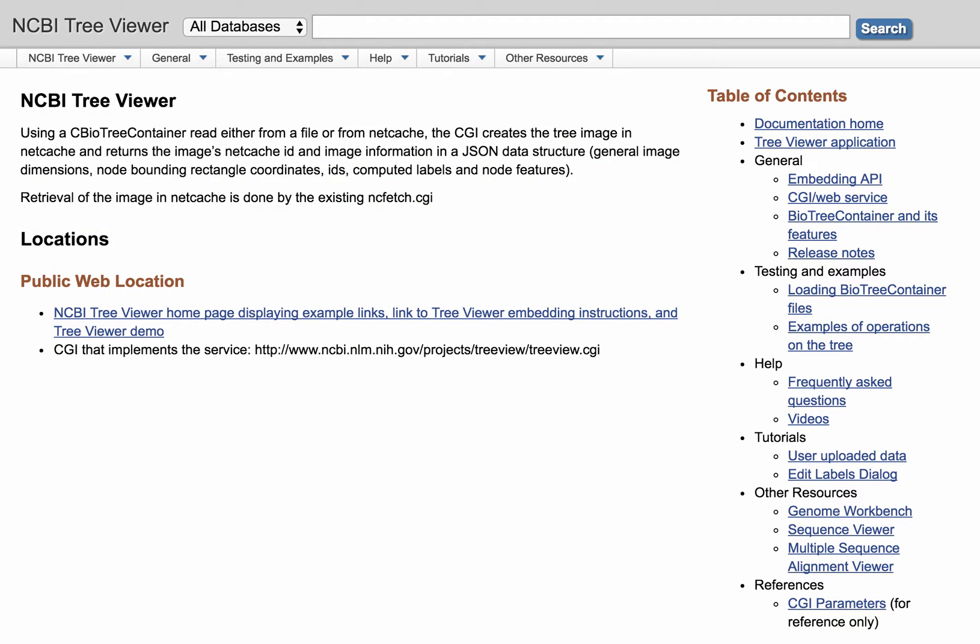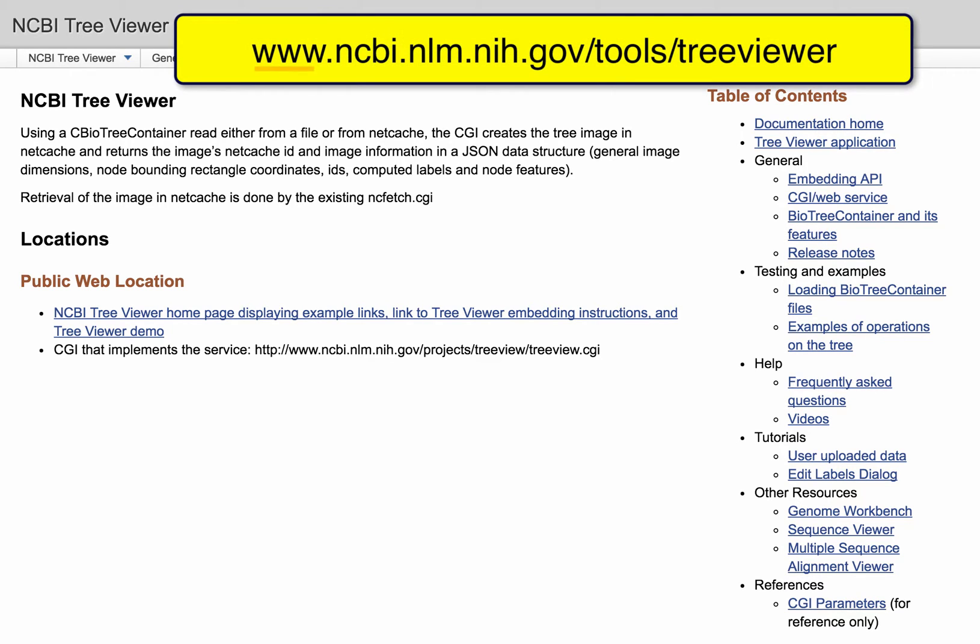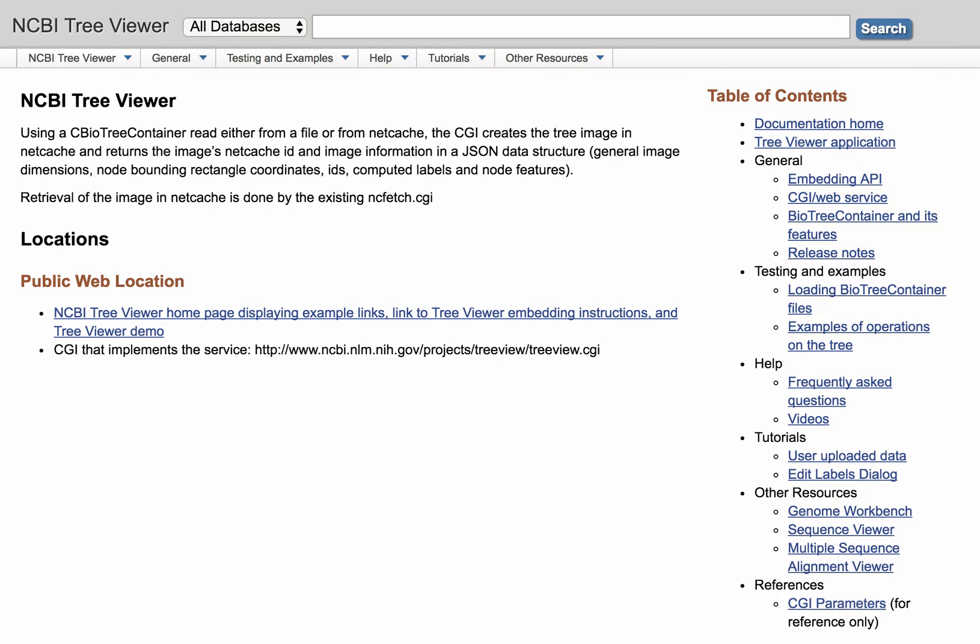This video is about new functionality which enhances the display of much larger trees. I am currently on the TreeViewer documentation page. The URL is the base NCBI URL, followed by forward slash tools, forward slash TreeViewer.